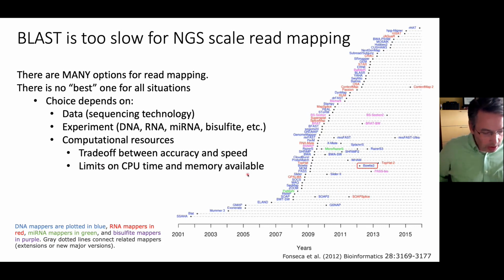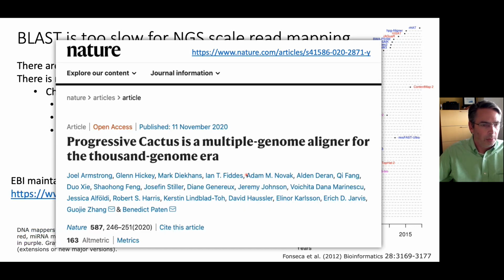Now, one consideration is if you have a really big resequencing project. Mapping, what we're going to do today, is relatively fast compared to genome assembly. Because, like BLAST, it's looking for exact matches first, right? Let me skip ahead 2 slides.